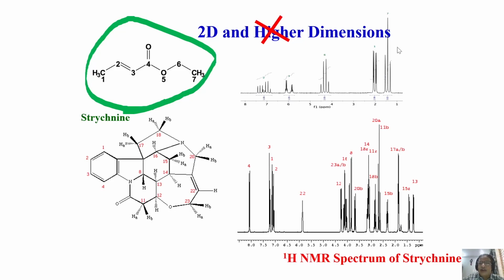Frankly, here you took, let's say, 5 minutes to analyze. Here you may take 15 minutes or half an hour to analyze. Take 1 or 2 hours if you want to completely assign and extract the coupling information. Everything, if you do, will not take more than 2 to 3 hours maximum.